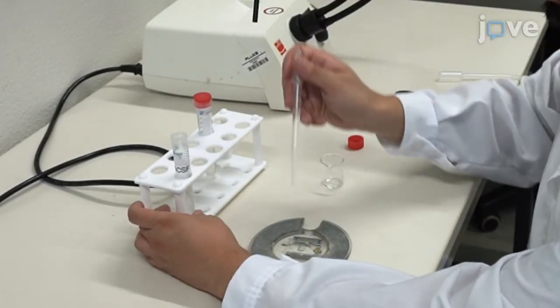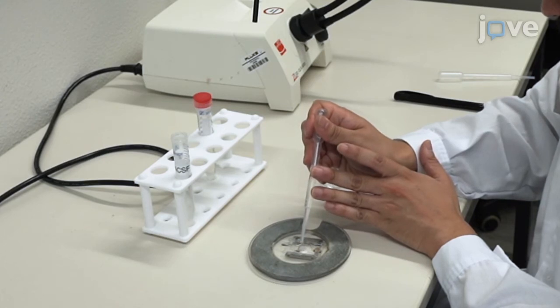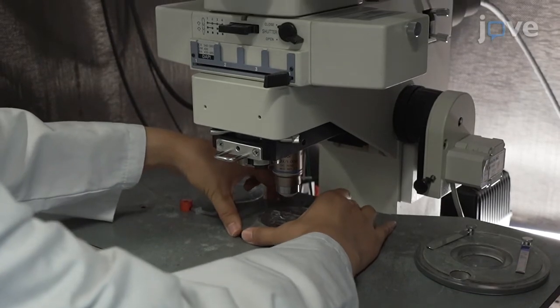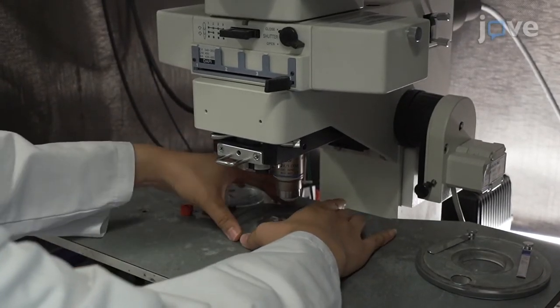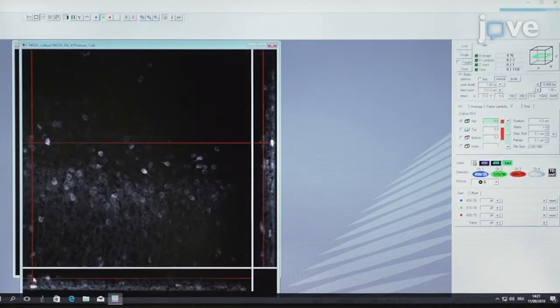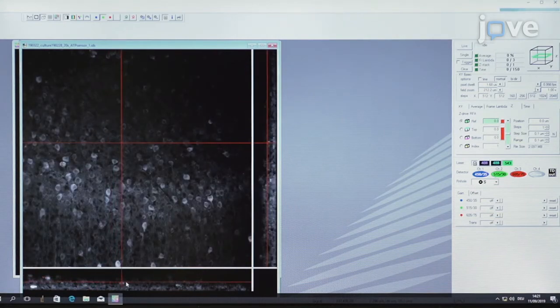Directly after the recordings, exchange the experimental ACSF with HEPES buffered ACSF. Then, transfer the recording chamber containing the slice culture to the confocal laser scan microscope. Take Z-stack images at the highest Z resolution possible at the given optical configuration.